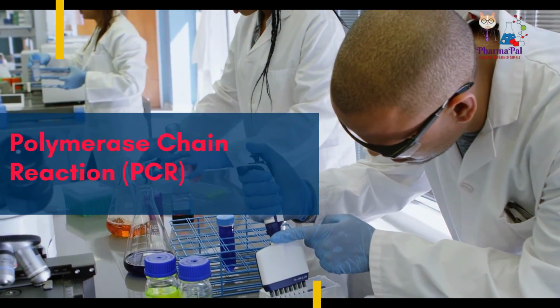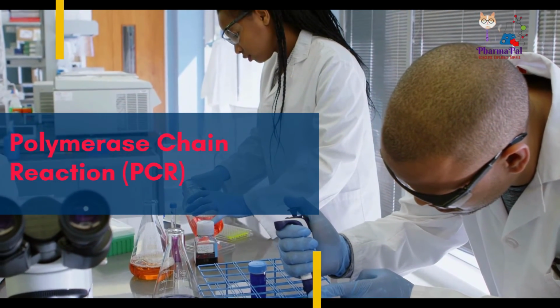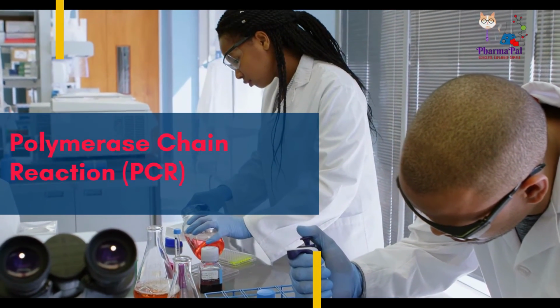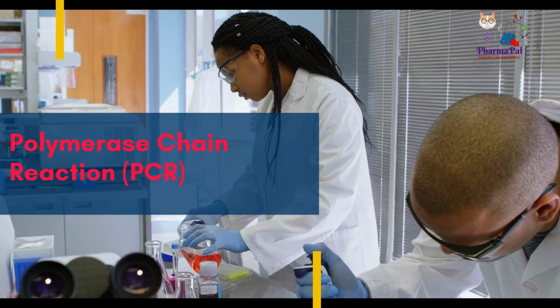Polymerase chain reaction. Welcome to our YouTube video on the fascinating world of polymerase chain reaction, or PCR. In this video, we will explore the development, methodology, and applications of PCR, all while providing clear and concise information. So, let's dive in. PCR, developed by Kary Mullis in 1983, has revolutionized the field of molecular biology.